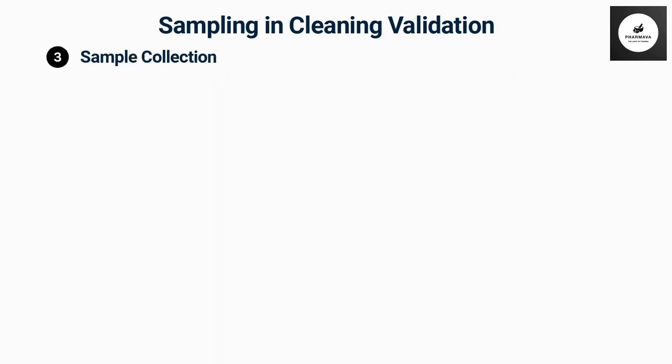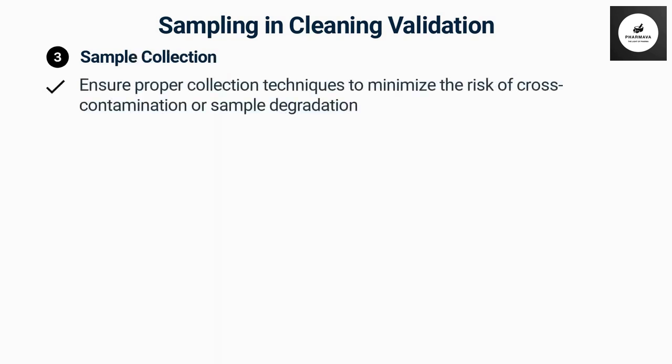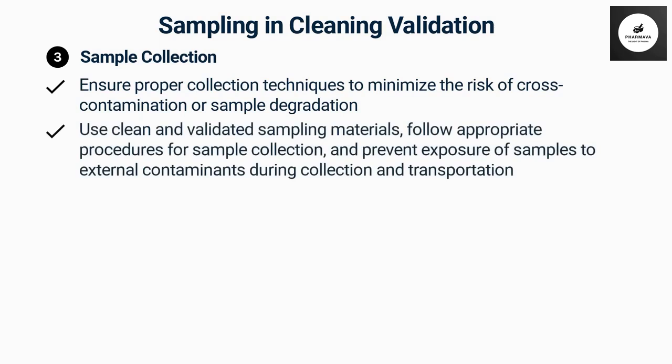Sample collection. Ensure proper collection techniques to minimize the risk of cross-contamination or sample degradation. Use clean and validated sampling materials, follow appropriate procedures for sample collection, and prevent exposure of samples to external contaminants during collection and transportation.